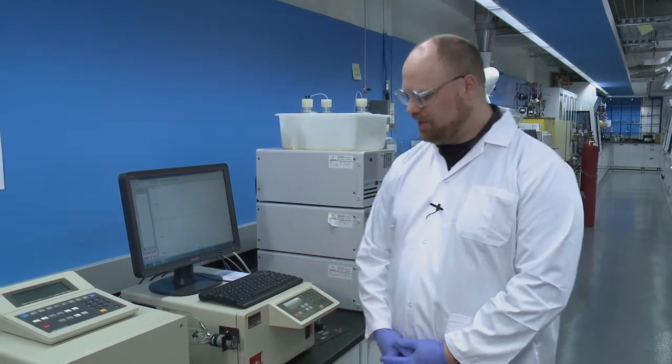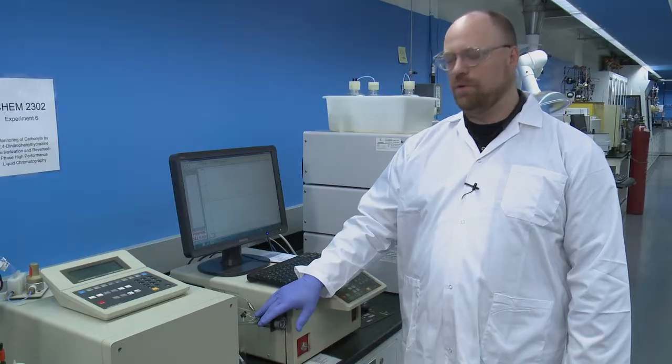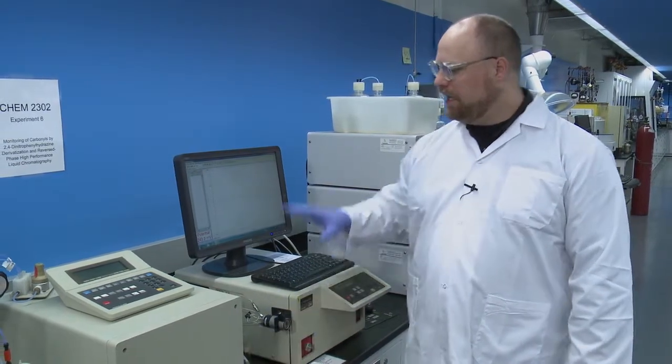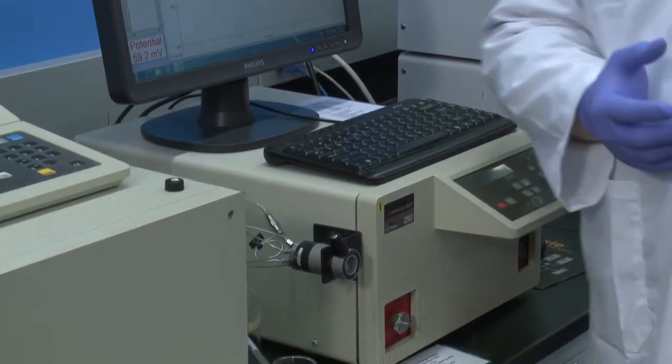My name is Graham. I'm here to show you how to use the HPLC that you'll be using in CHEM 2302 and 2303. The HPLC consists of a pump, a detector, an injection port, column, and then a computer to collect your data.